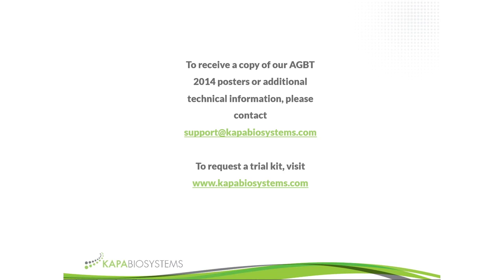The advantage of the qPCR assay is that it's much more sensitive than Qubit and spectrophotometric assays. Just to give you an idea, the copy number range on our human genomic quantification and QC kit goes from 12 copies to about 3,000 in the assay. So it allows you to at least get relative quantification data from samples that are very low concentration or very damaged.